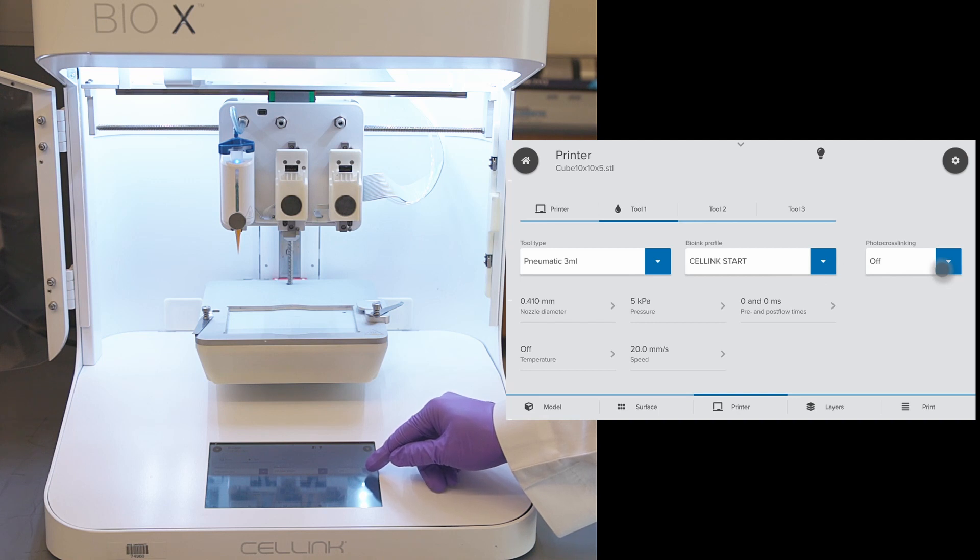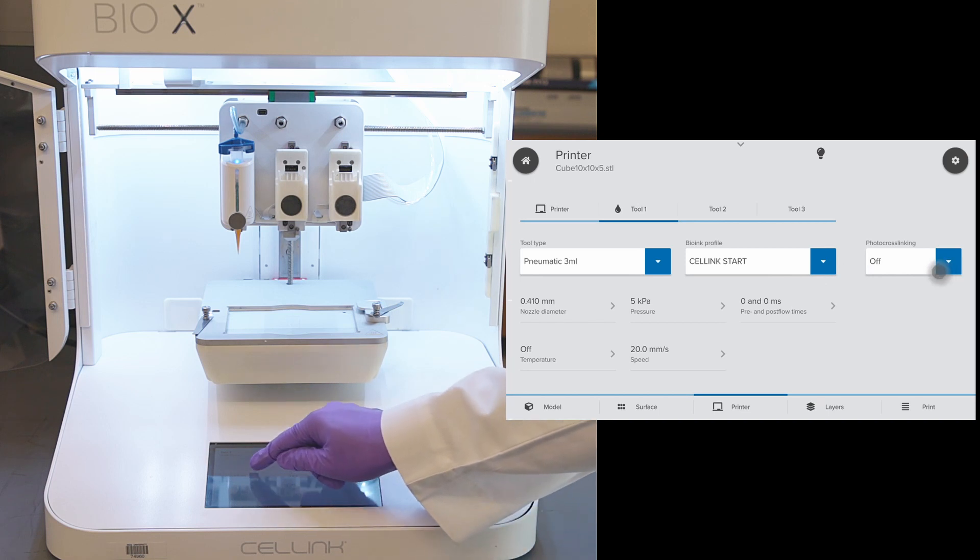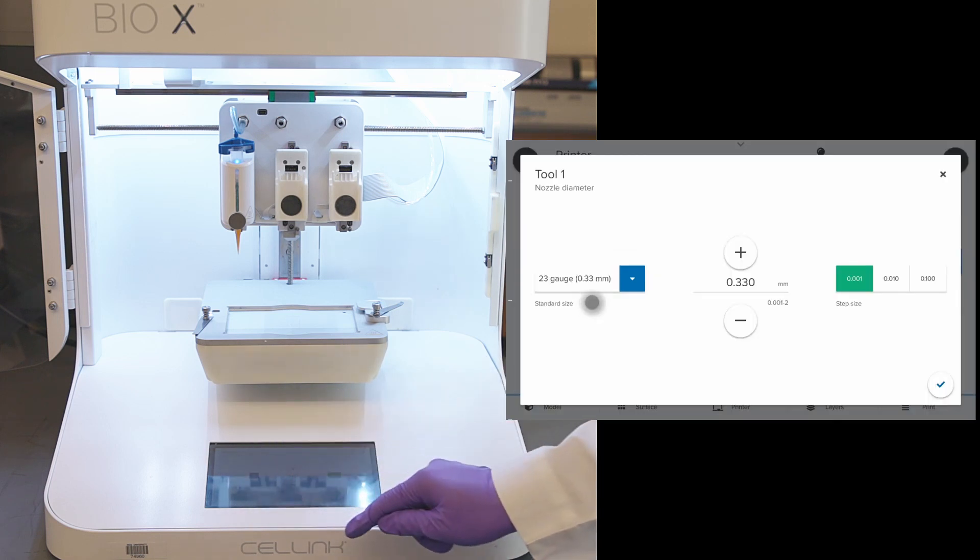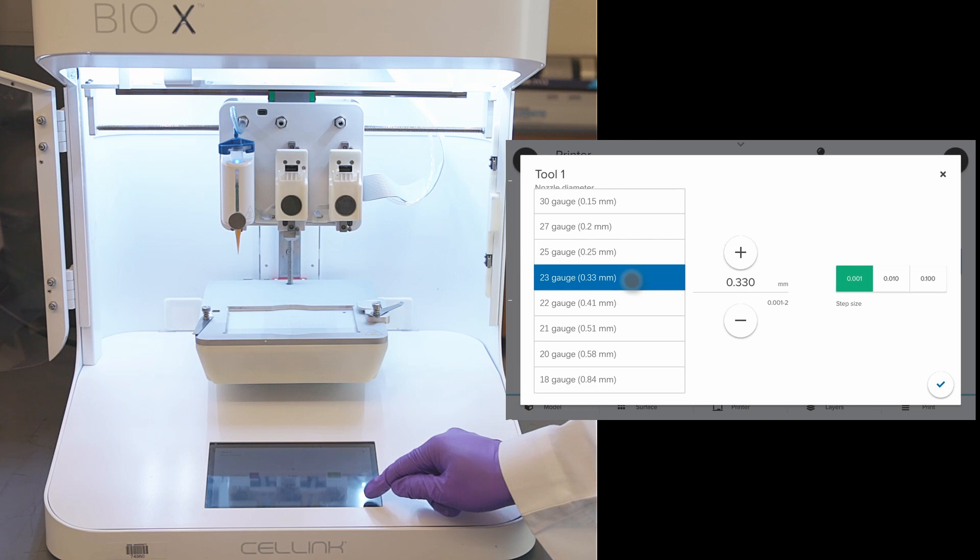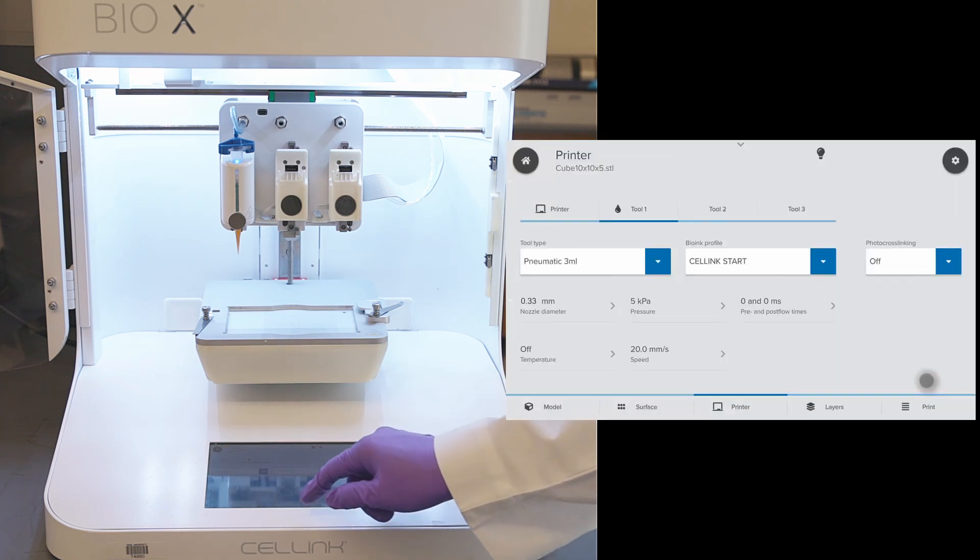Again, we have options for photo crosslinking to be enabled or disabled. Next is the nozzle diameter. Today, we will be using a 23 gauge nozzle and click OK to accept the changes.